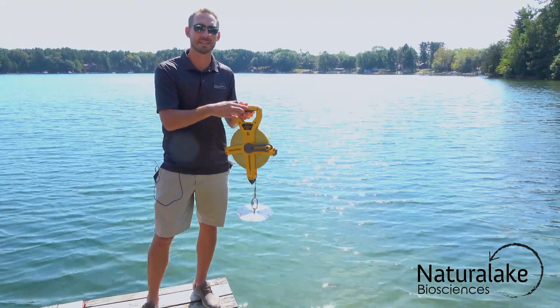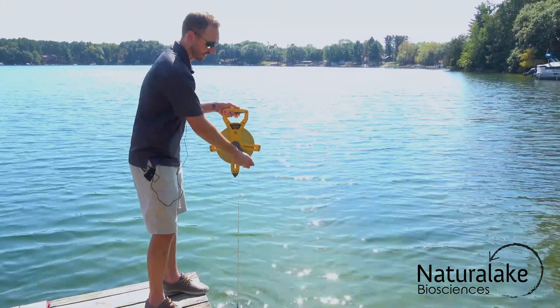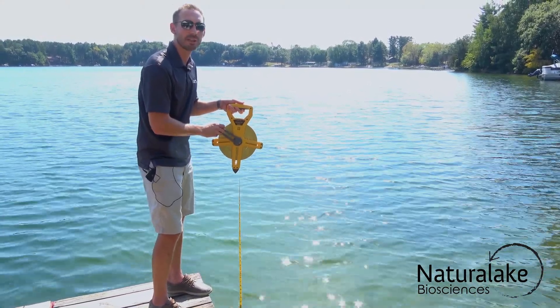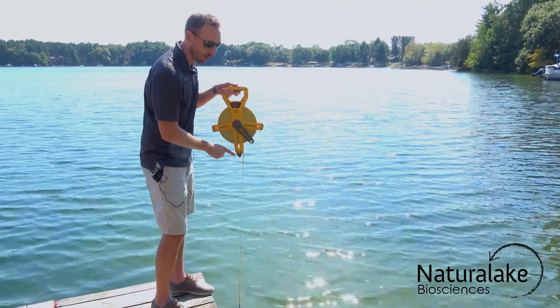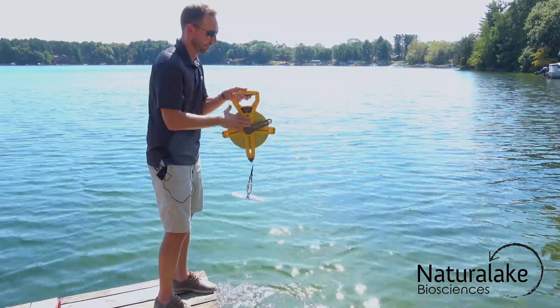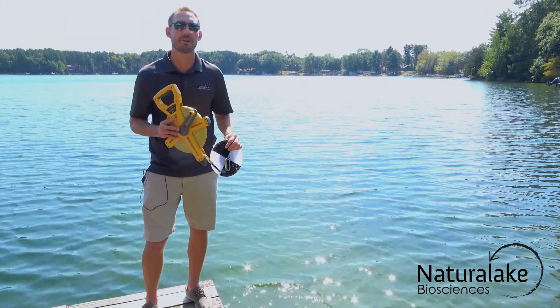Take the disk and drop it down into the water until you can no longer see it, then reel it back slowly until you can first start to see the disk. Take note of that measurement and then reel it the rest of the way. Repeat that process and then average out the two measurements.